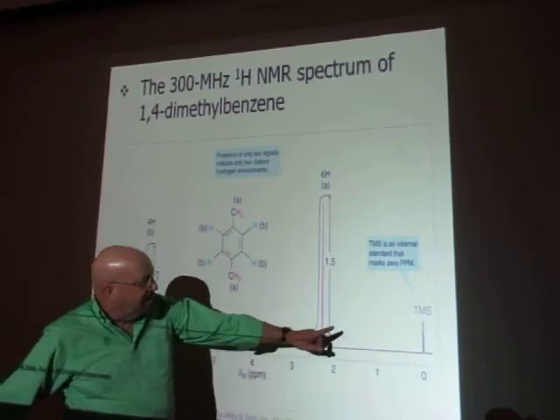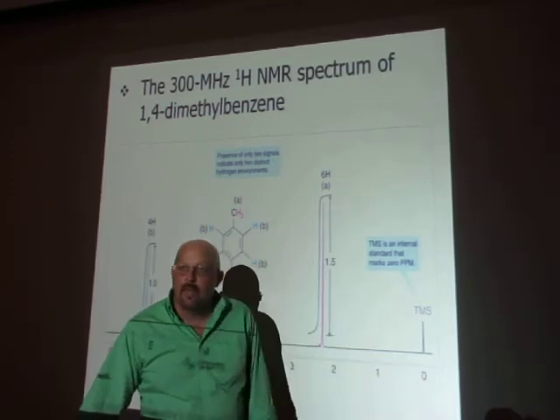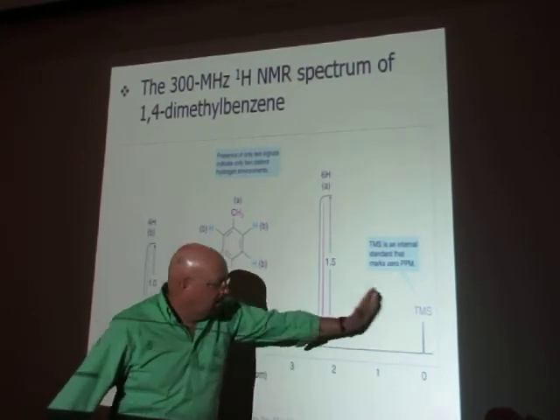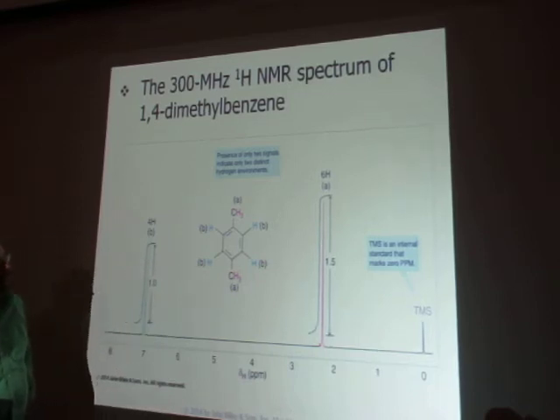By the way, there's our TMS. That's our reference compound coming right at 0 ppm. So everything's referenced to that, so we know the exact position of these peaks because that's set to 0. Any questions on that?